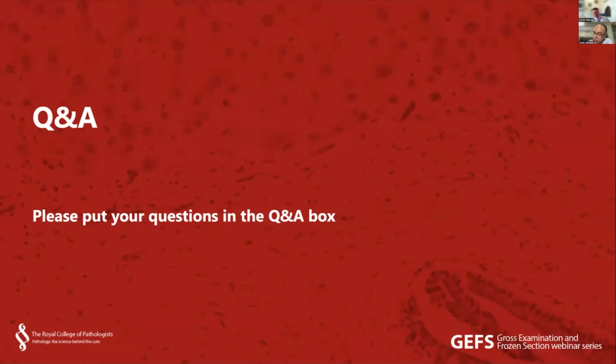So where it is used, most departments don't use it, but I think there could be an argument for using it in particular situations where you've got a difficult case, in which case the MDT are probably going to be happy to wait. But most labs, most of the time, don't really use it.